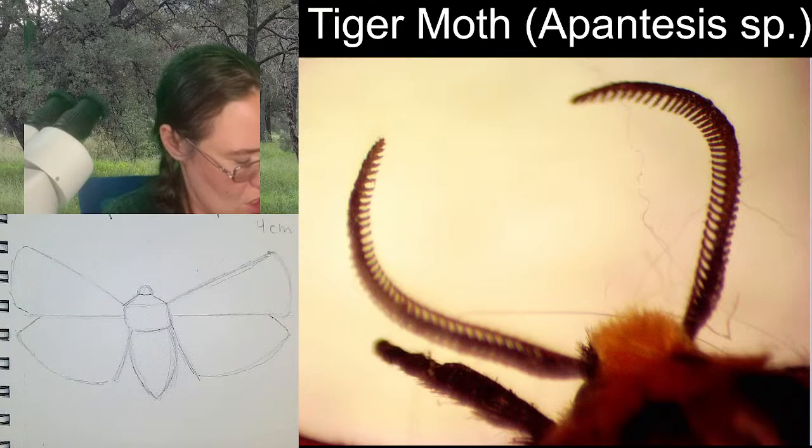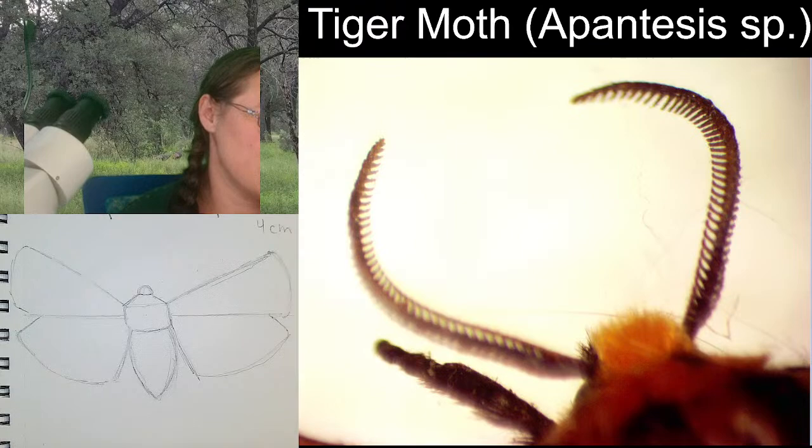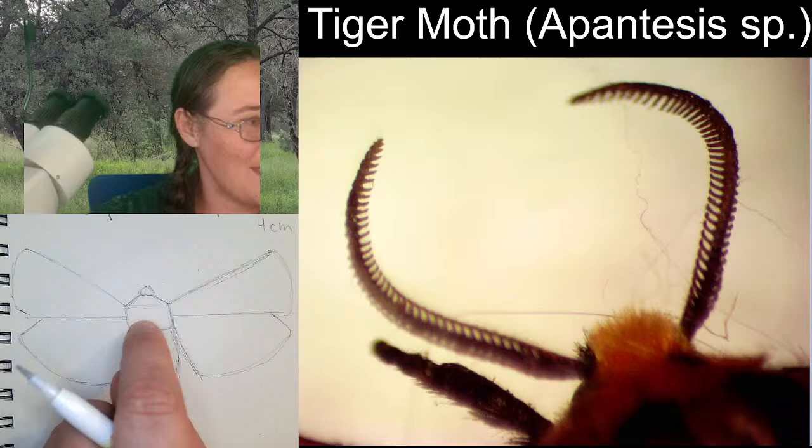So, this specimen, I was going to say this when we were looking at it. Let's see, other light. Maybe more light. It has these two darker spots right here on the first segment of the thorax that almost make it look like eyes, and I wonder if that's a defensive mechanism. You can't really see the compound eyes very well because it's so setose, or so fluffy.